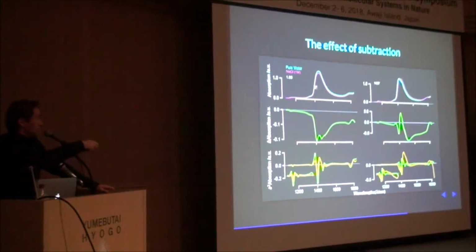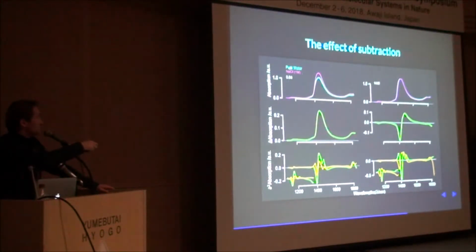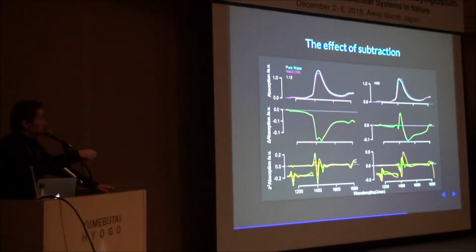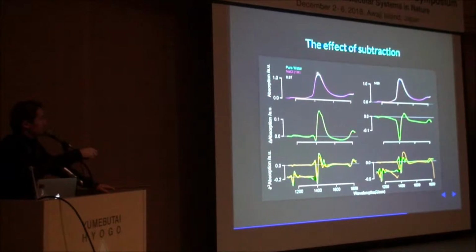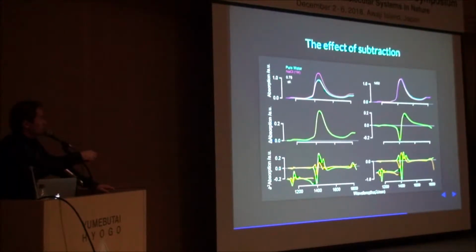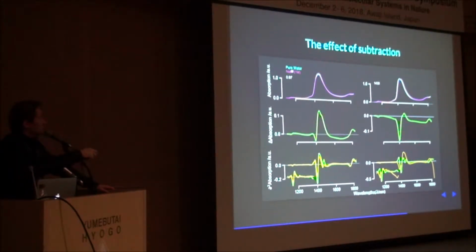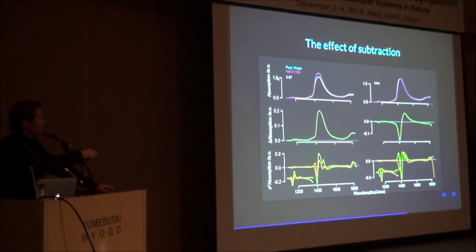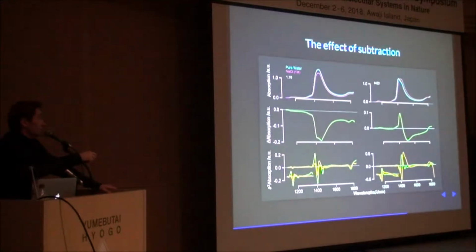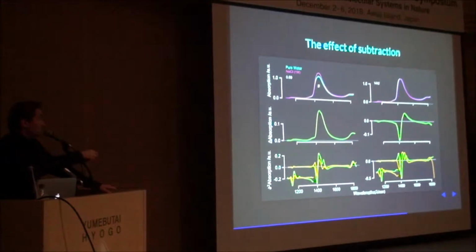So there are 6 panels. On the left vertical, what's happening is that the spectrum of pure water, which is in cyan, is being scaled from its normal value to the value of the sample and below. And this is the scaling coefficient. So this is the normal room temperature. When we go to 1, this is 1.2. So this is the scaling coefficient of water. This is where pure water is. 1 is where it is untouched.